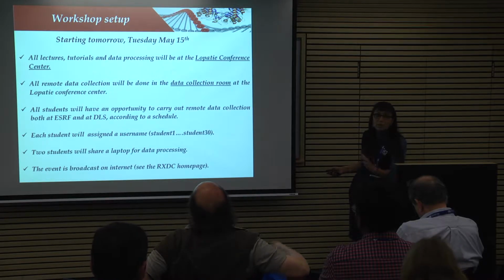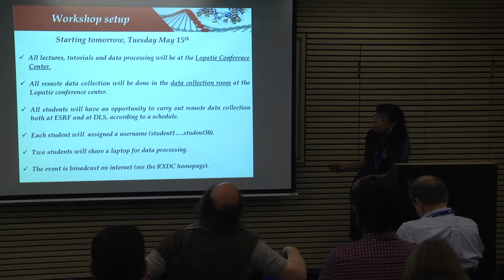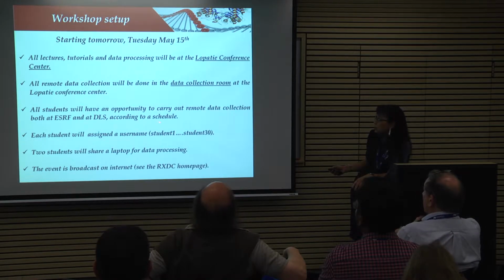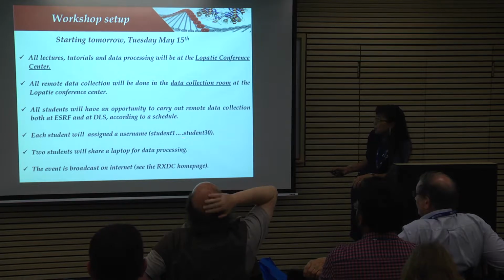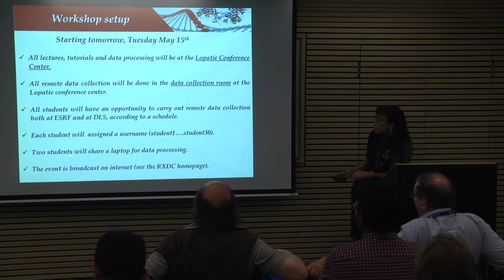All the students, even the ones who did not send their own crystals, will have the opportunity to remotely collect data, either on test case crystals, if they didn't bring their own crystals, or on their own crystals, both from ESRF and DLS. Again, I'm going to show you the schedule very soon. We're going to give you a username. In a minute, you'll see which one you got. You have it in your handouts.